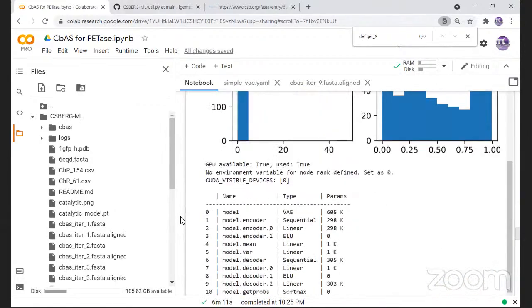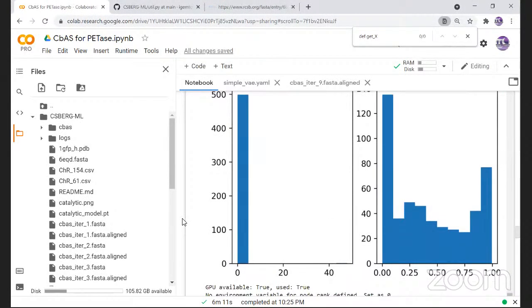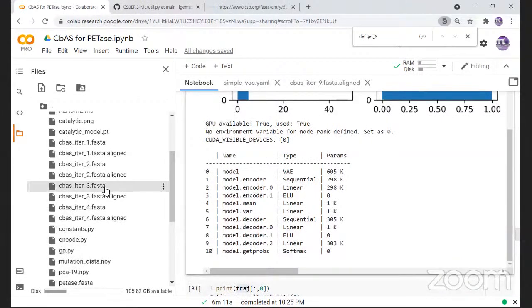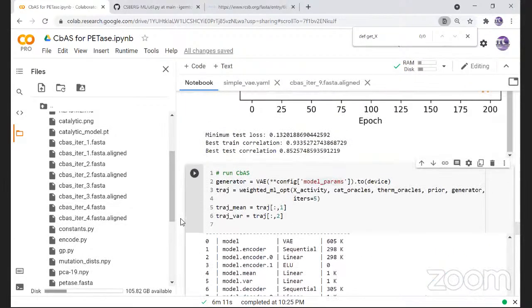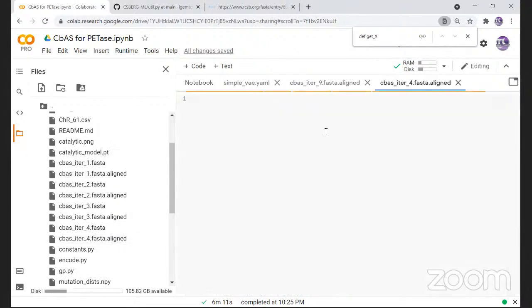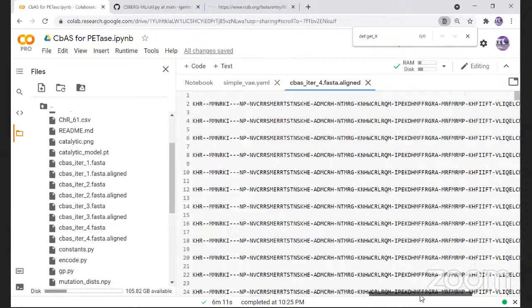Okay, it has completed. Wow. So it's a crazy experience. So that was 5 iterations, I think. Where's, okay, well, I guess it's 1, 2, 3, 4, and there's no 5. Oh crap. What the hell is this?